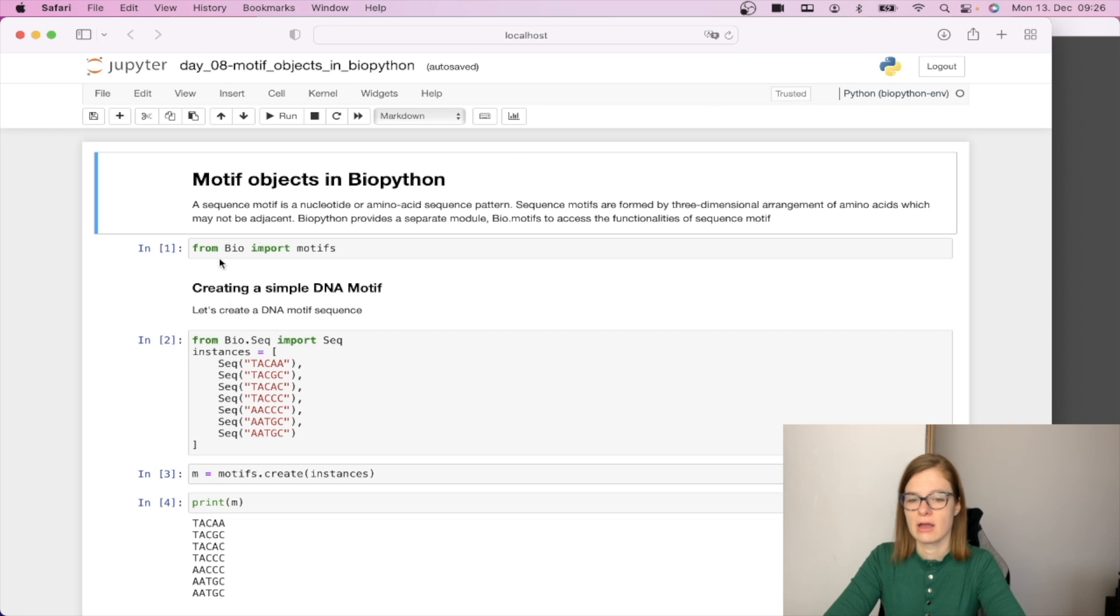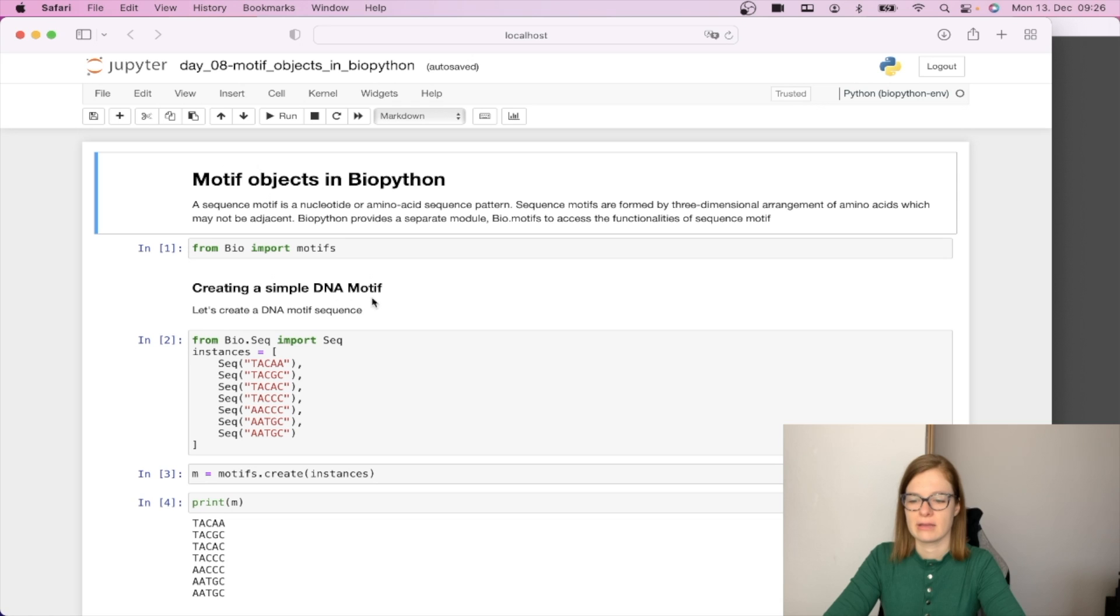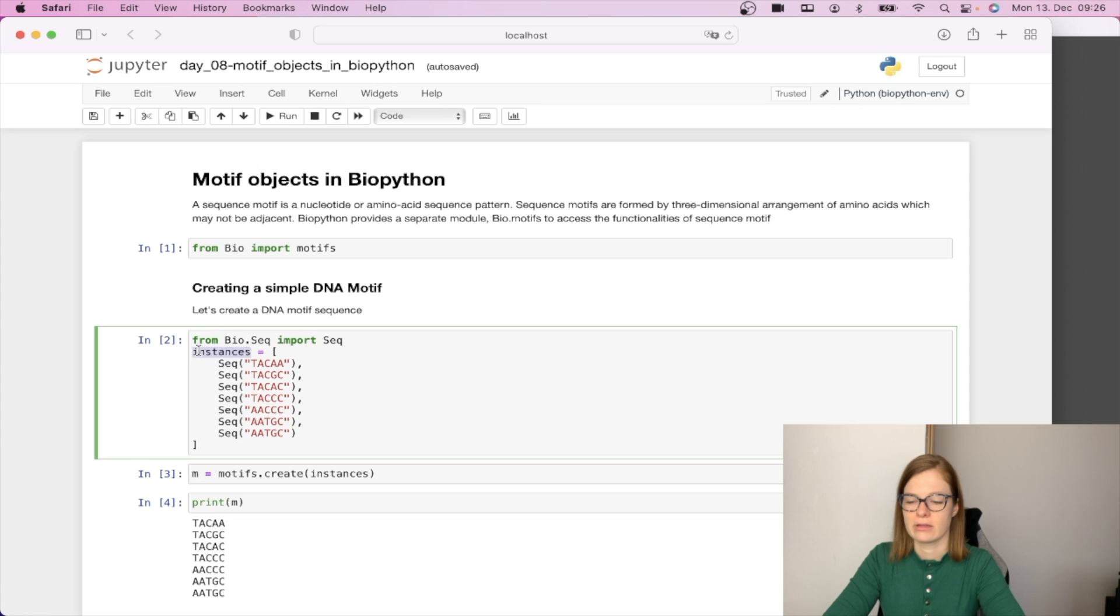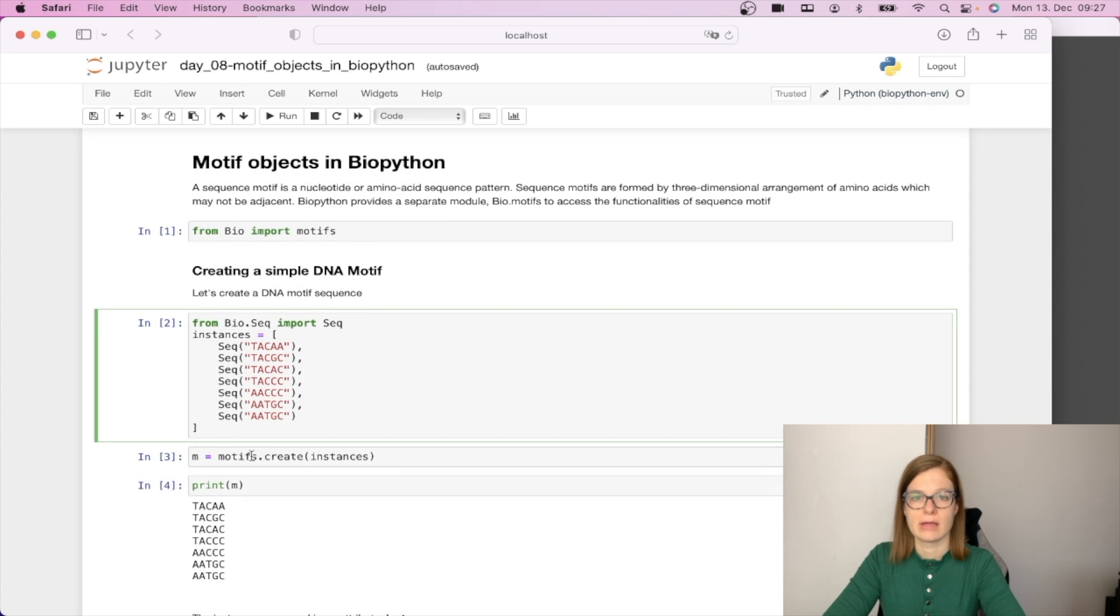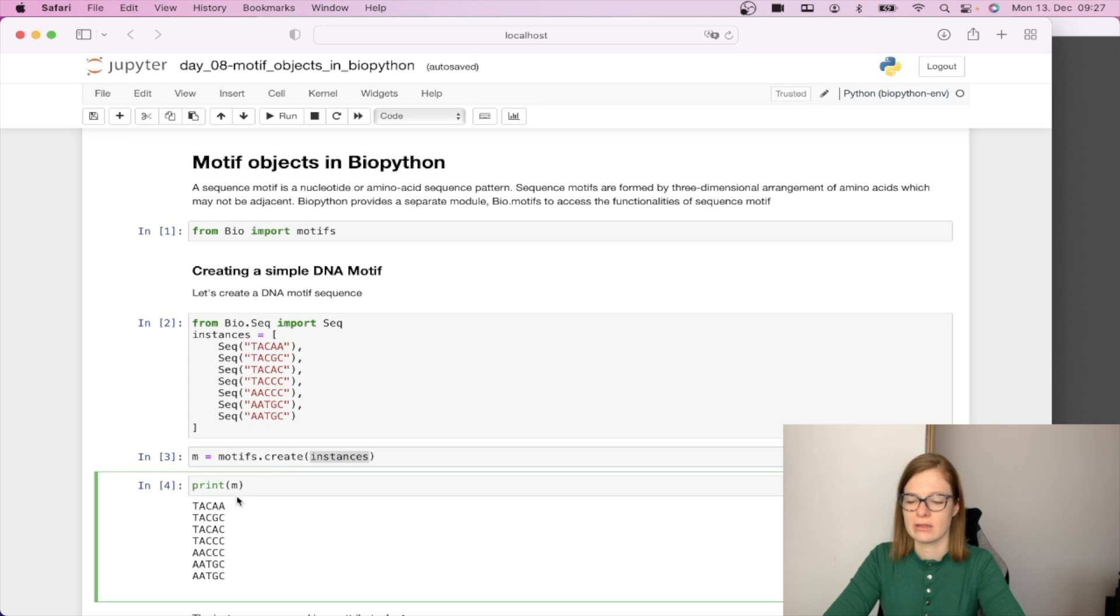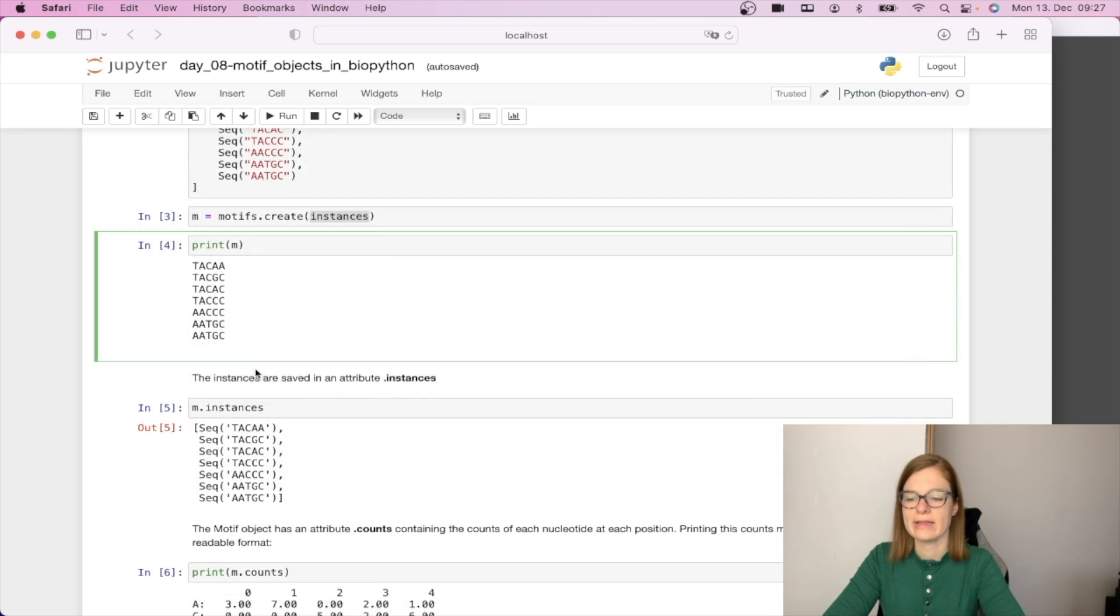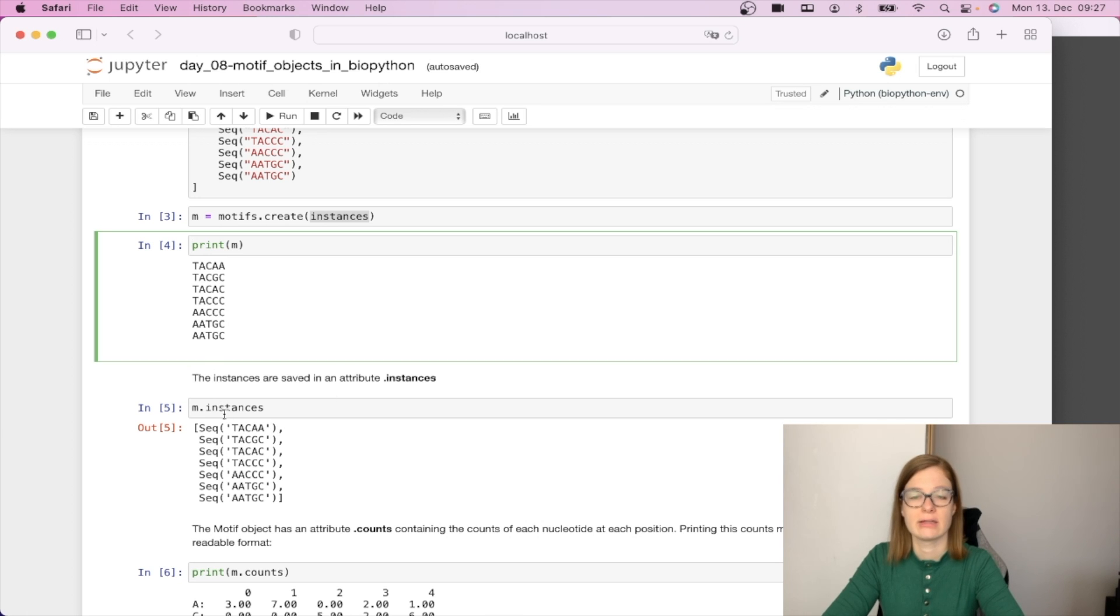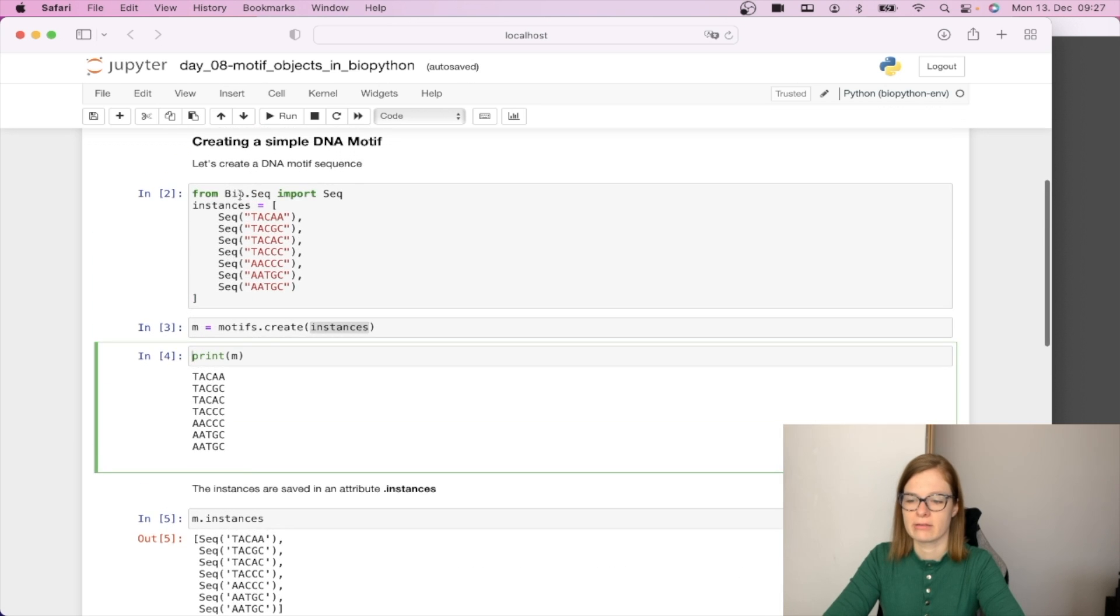So let's start by importing motifs from Bio and let's create a simple DNA motif. We are going to create a list of sequences and store it in the instances variable. We can create motif objects by calling motifs.create on the instances. If we print it we get all the sequences from our instances list. We can access all the instances from motif objects by calling the dot instances attribute. This will give us back all the sequences from the initial instances list.